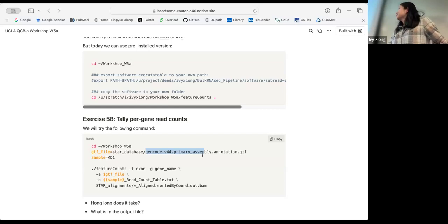Usually the same experiment samples were sent for sequencing together, so I tend to align them and aggregate them together. But you can also do that for different data sets. For example, I have sequenced mouse samples myself, and I've downloaded other people's mouse data. Once I have aligned and processed them, I can also tally them together, and it's going to be one giant table. So multiple samples, no problem. From different experiments, no problem. Just make sure that they're the same species using the same reference genome.